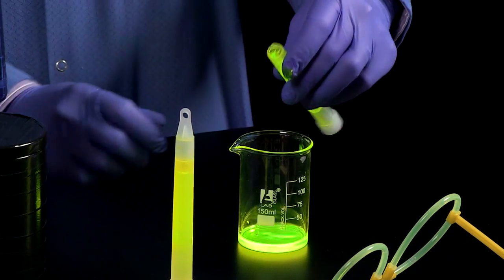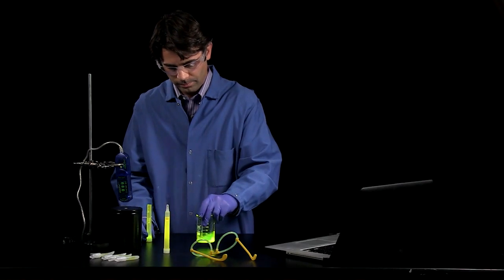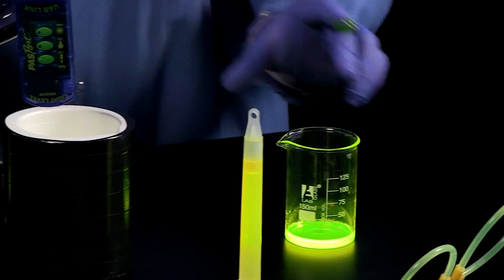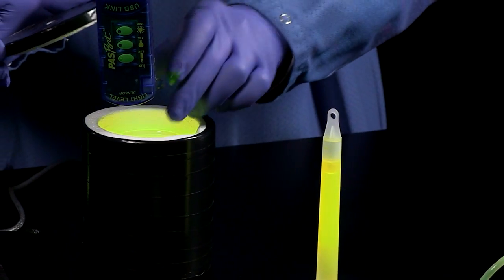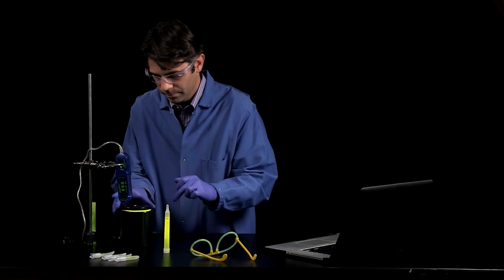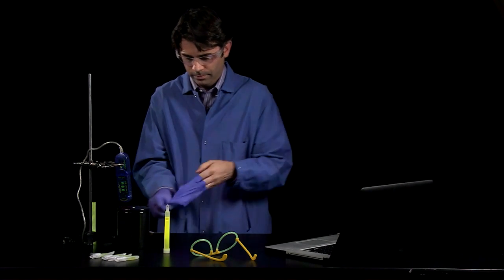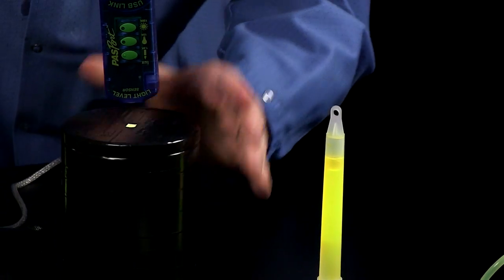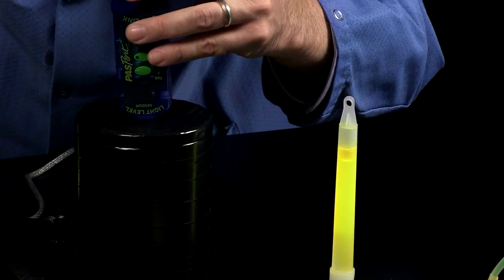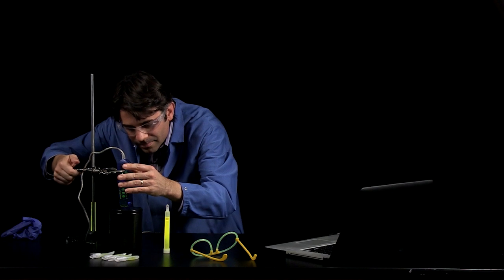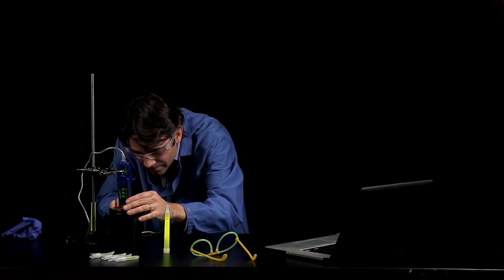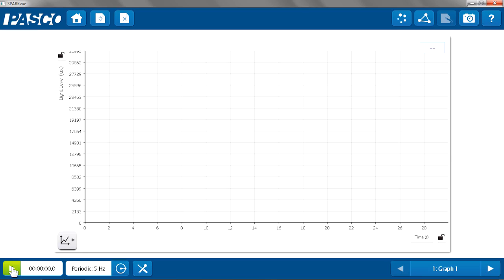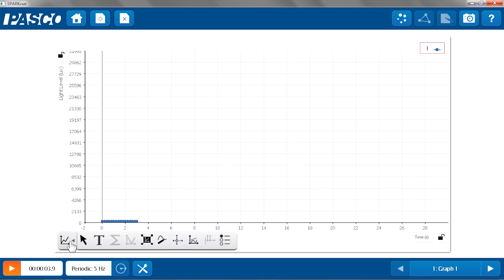Now, I'm going to make sure they're nice and mixed, and I'm going to put them in my vessel. Line up my light sensor and start data collection. I'm going to auto scale the graph.